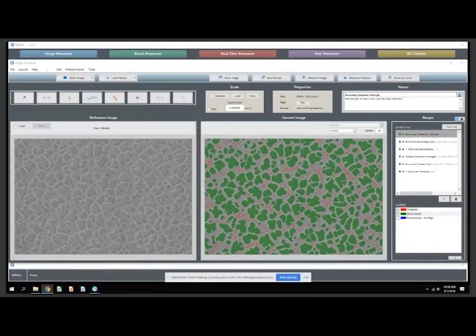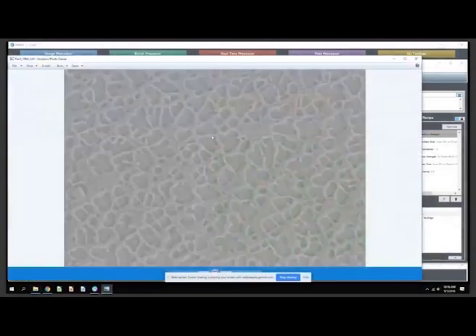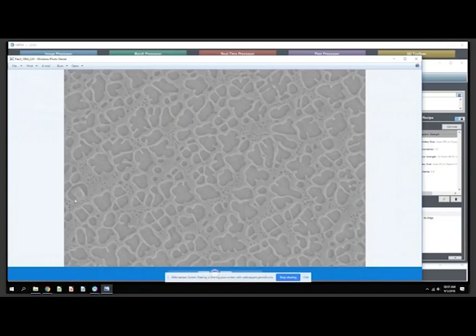That was one of the challenges that they struggled with. Well, there were four really. One, they needed to handle brightness variations image to image. You can notice that here's one image, and here's another image. It's slightly lighter, slightly less contrast. There were even some gradients in some images. So they had to have an algorithm that worked in the presence of gradients and overall contrast variations. So there are pre-processing steps in the recipe that get rid of gradients. This edge find approach is rather agnostic to overall intensity changes.